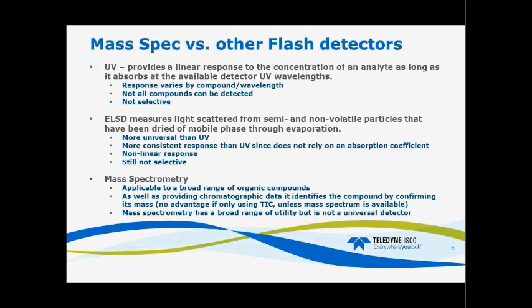And based on some simple fragmentation, you can oftentimes see the loss of an amine group, chlorine, or bromine, which are easy leaving groups that can be cleaved off during the ionization process. So you verify your target ion, and you can also glean some information into compound structure.